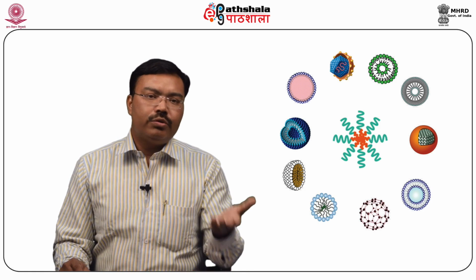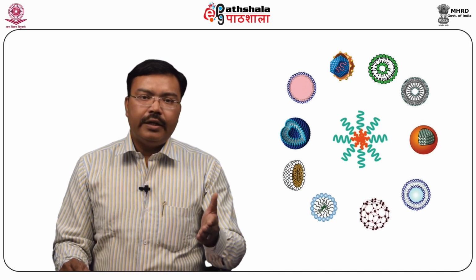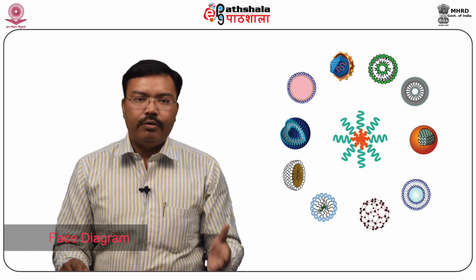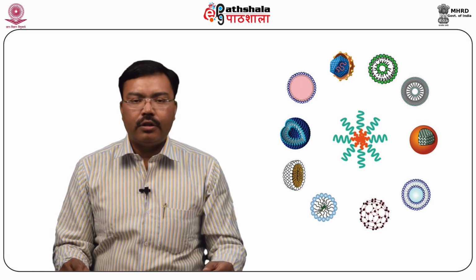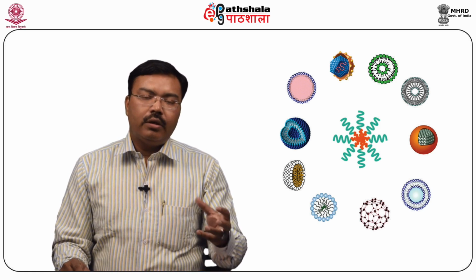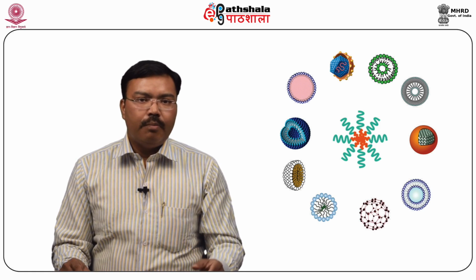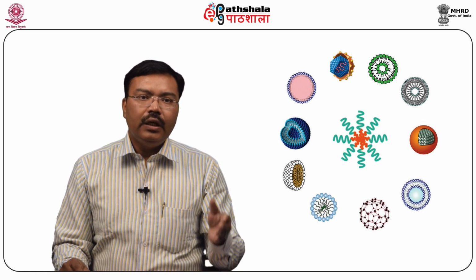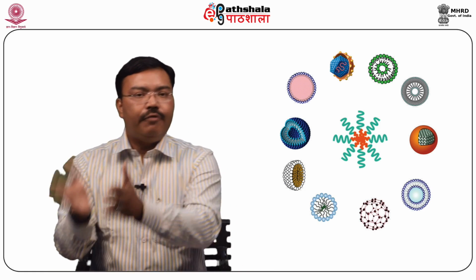Here we use a tungsten halogen lamp, which directs light through the collector lens and focuses it on a specialized annulus positioned in the substage condenser front focal plane. This light, as a wave front passing through the annulus, illuminates the specimen, either passing through undeviated or diffracted.